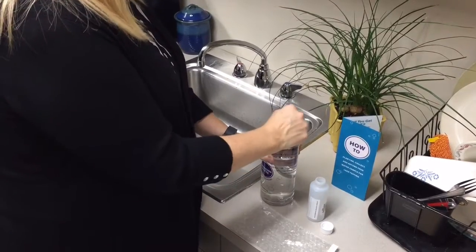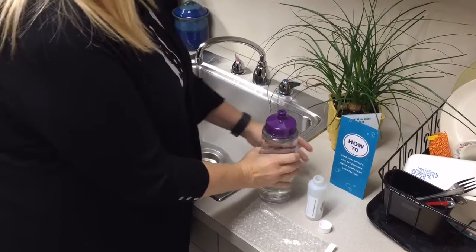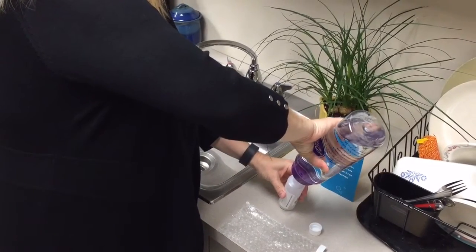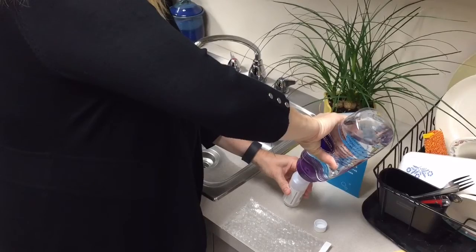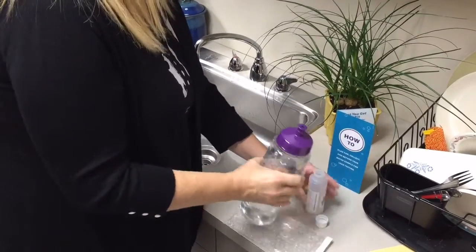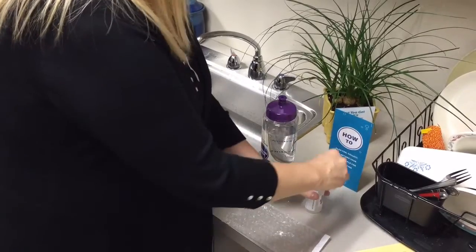Remove the lid from the large sports bottle and pour the water from the large sports bottle into the small sample bottle. Put the lid back on the small sample bottle and screw the lid on tightly.